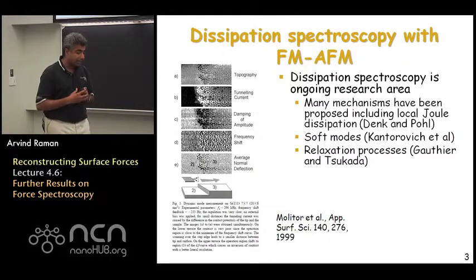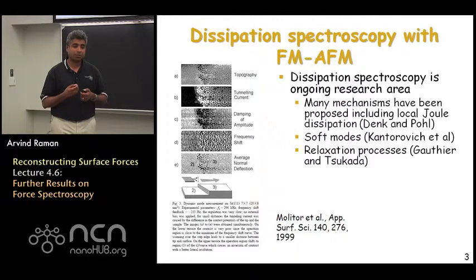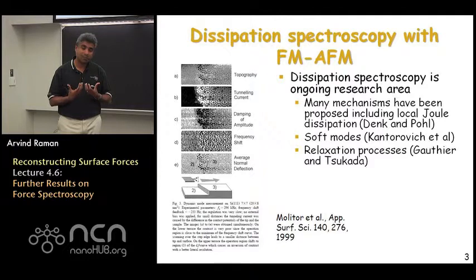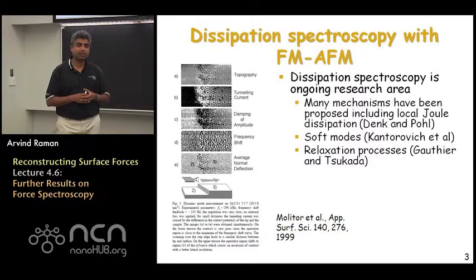And from the early days, it was recognized that one could also start doing spectroscopy, which is to approach the sample and try to understand how this dissipation signal changes, and more importantly, what does it tell us about the sample? What physical properties is the dissipation signal related to? So this is called dissipation force spectroscopy, whether it's in the scanning mode, trying to interpret the dissipation maps one gets on a sample, or if one actually approaches a sample, if one is doing it at high resolution, might approach an atom, try to understand what the fundamental dissipation mechanisms are.